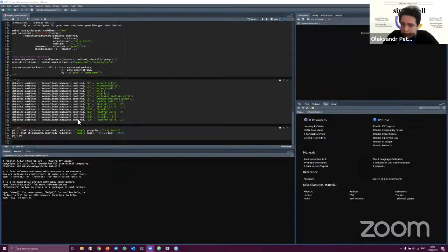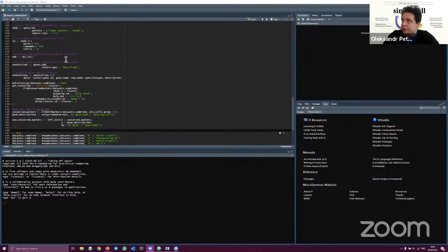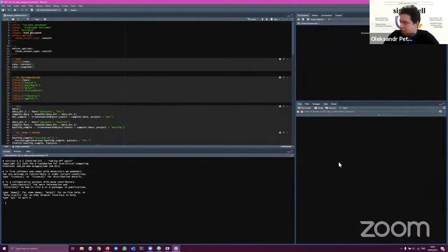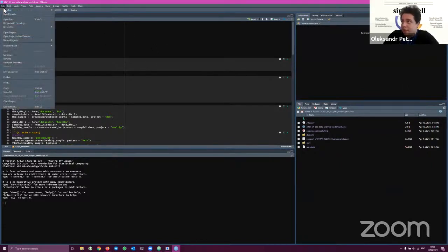If you work with your own RStudio, and I guess you can see my screen right now. So if you work with your RStudio, what you should do, so let's imagine you cannot see this because it's not important now. In the lower right corner, there is the files section. And that's very important that you can see it. So the very first thing, and I will ask you to repeat it right now, so we can start this point. You should press File, right?